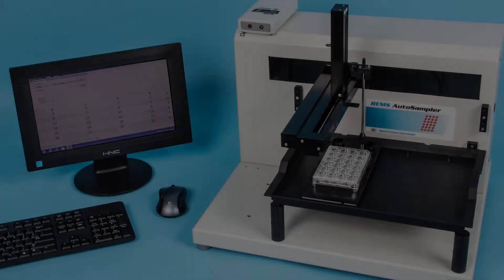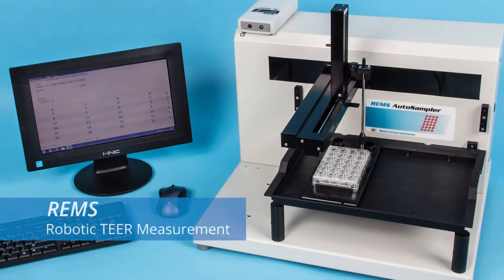Today we're going to talk about WPI's high throughput robot for automated tissue resistance measurement and the newly designed REM software.